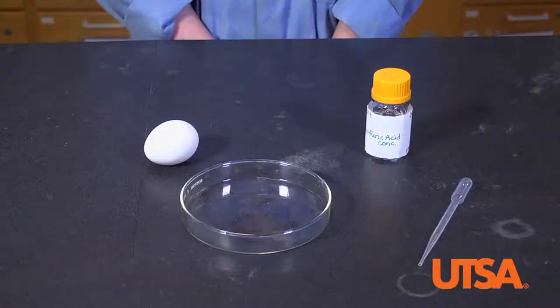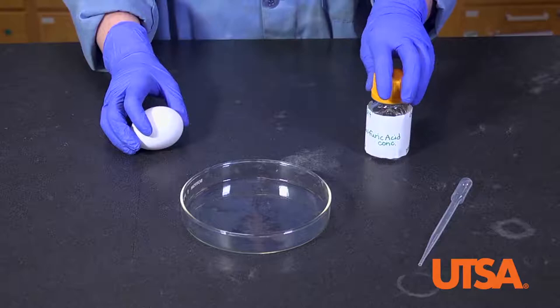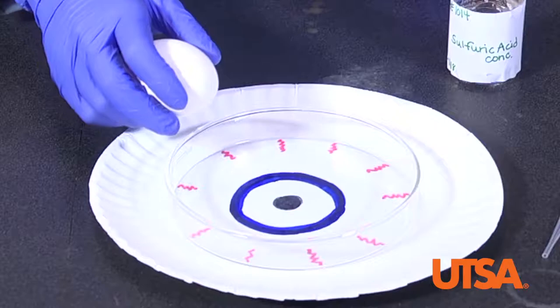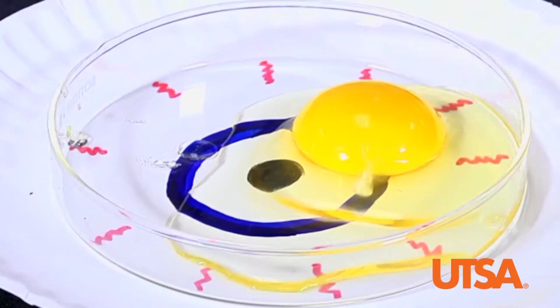For the first demo, we will be using an egg to simulate an eye's cornea to visualize how our eyes react in the presence of a strong acid or base. Let's start off with a petri dish. If you want to add to the visual, you can draw an eye on the bottom of a paper plate. Crack your egg into the petri dish and try not to break your egg yolk. Ask your students to observe the clarity of the egg whites, which is similar to the transparency of an eye's cornea.